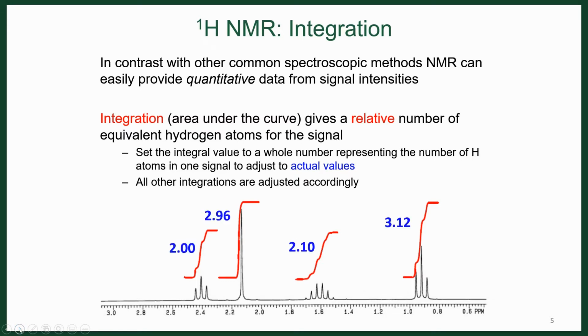So if we multiply each of these values by 2, we can see that we get closer to whole numbers that make sense. So here we would have this one go up to 2, this one become approximately 3, 2, and 3, associated with numbers that make sense for groups that we should be seeing in hydrocarbon-based species. CH2 groups, CH3 groups, CH2, CH3.